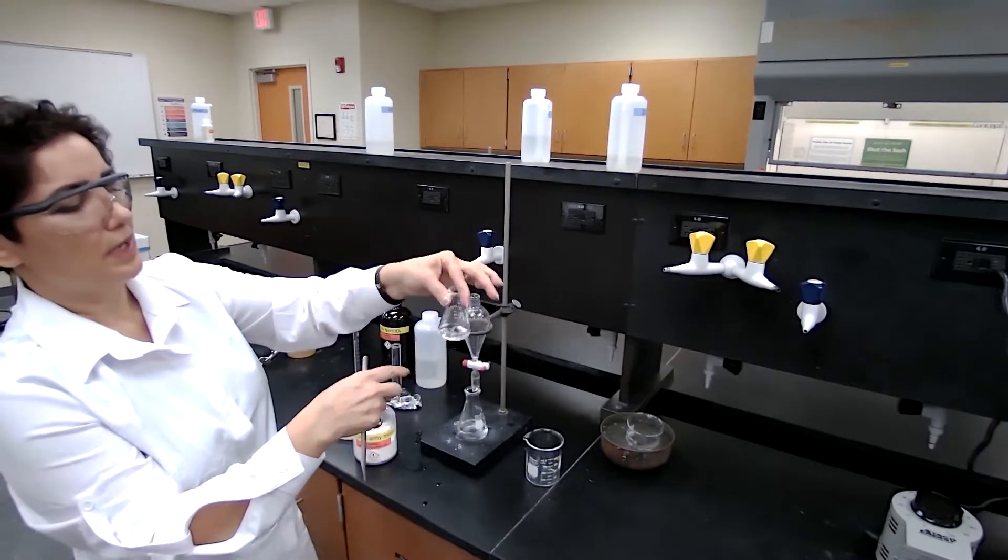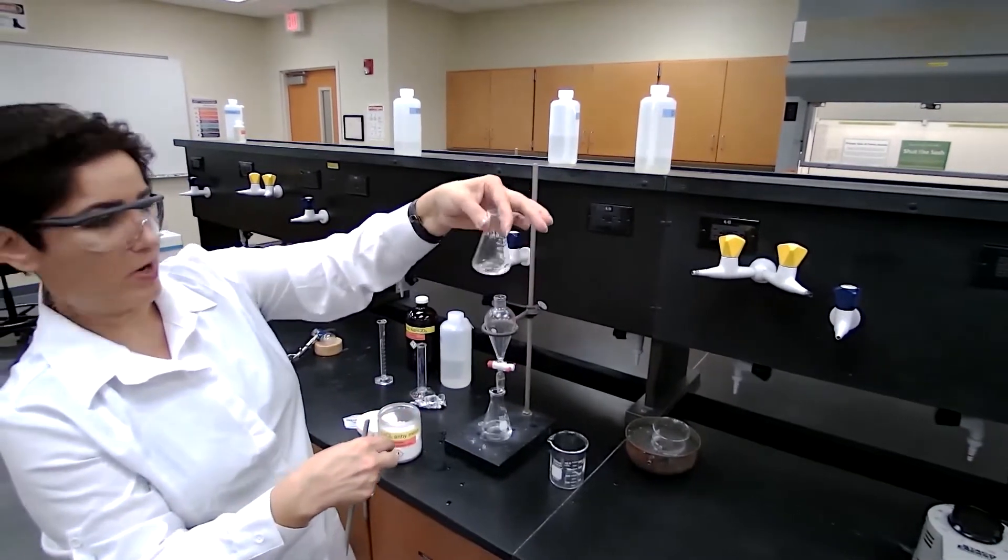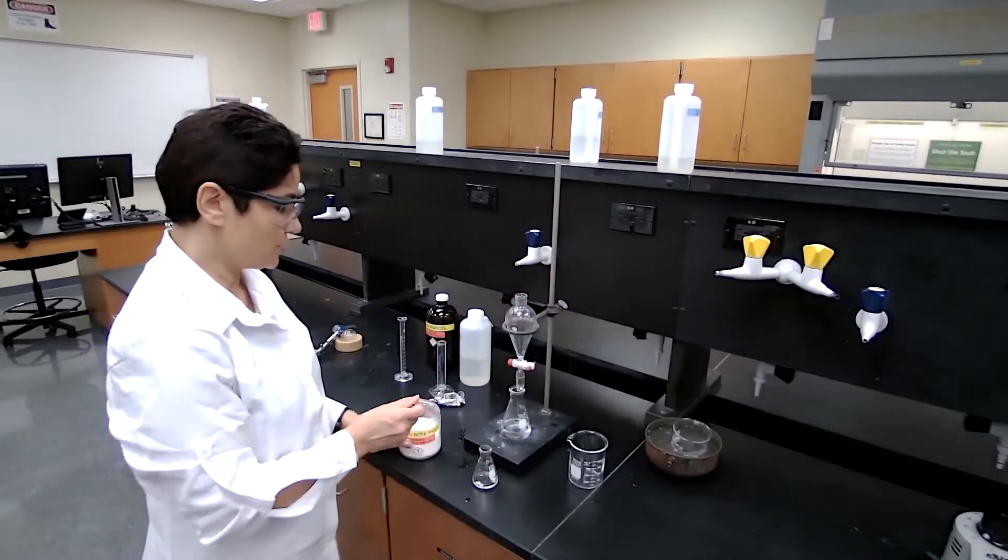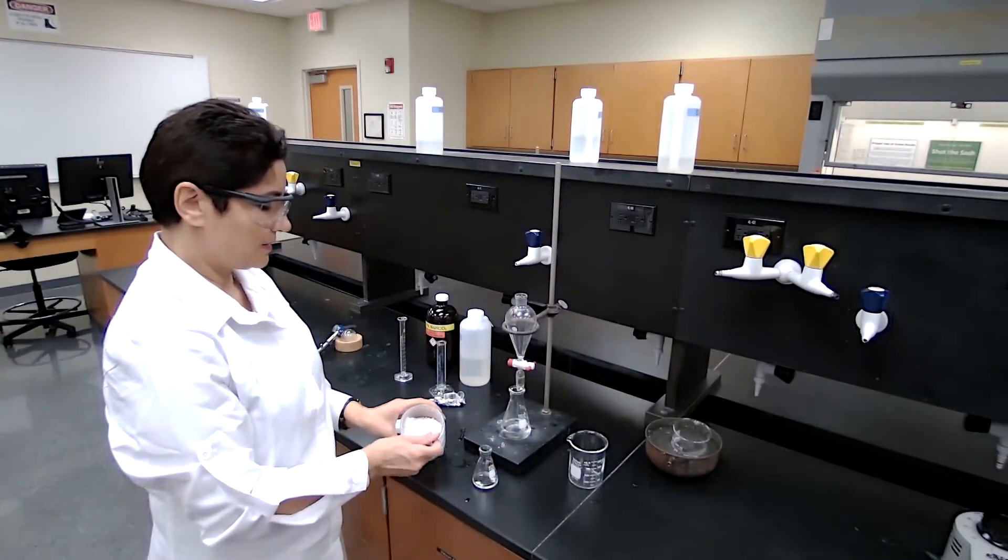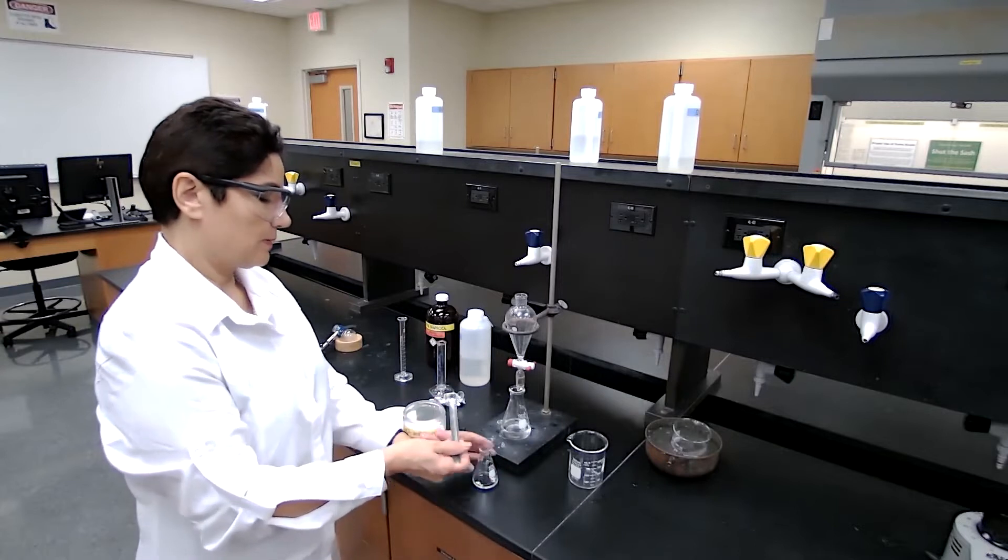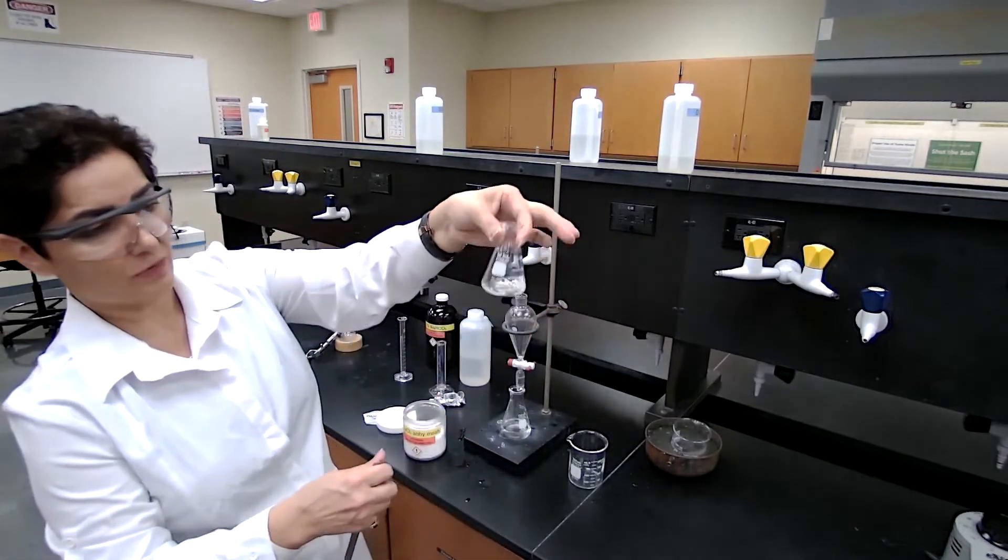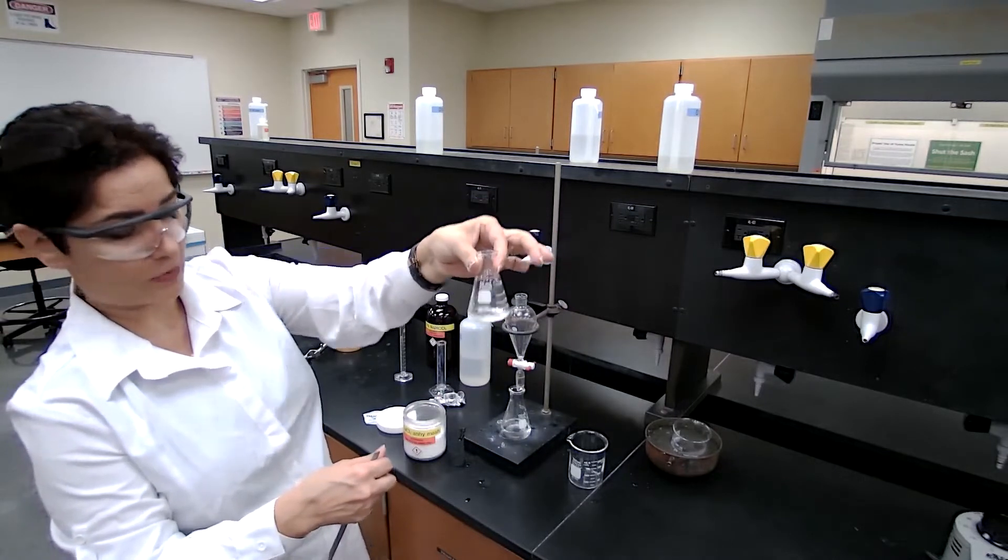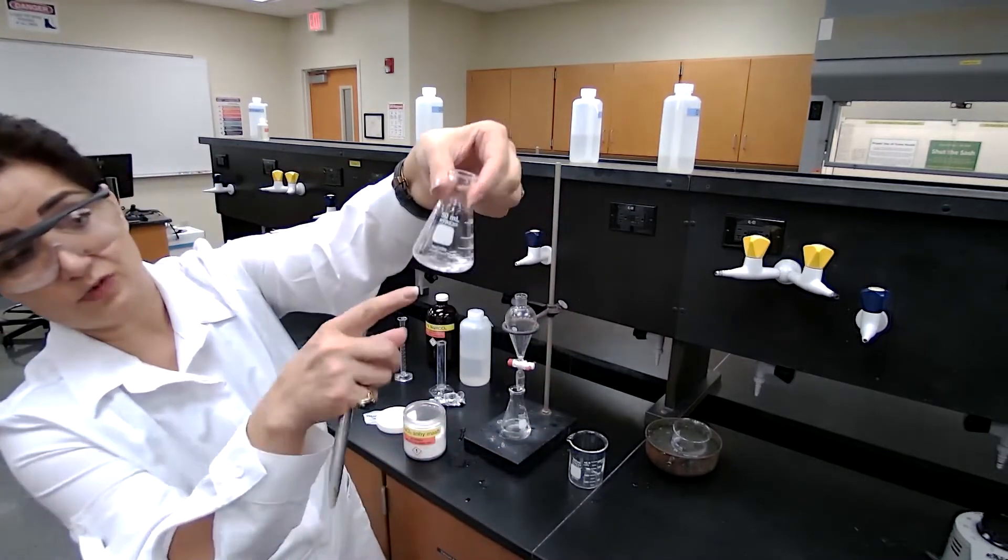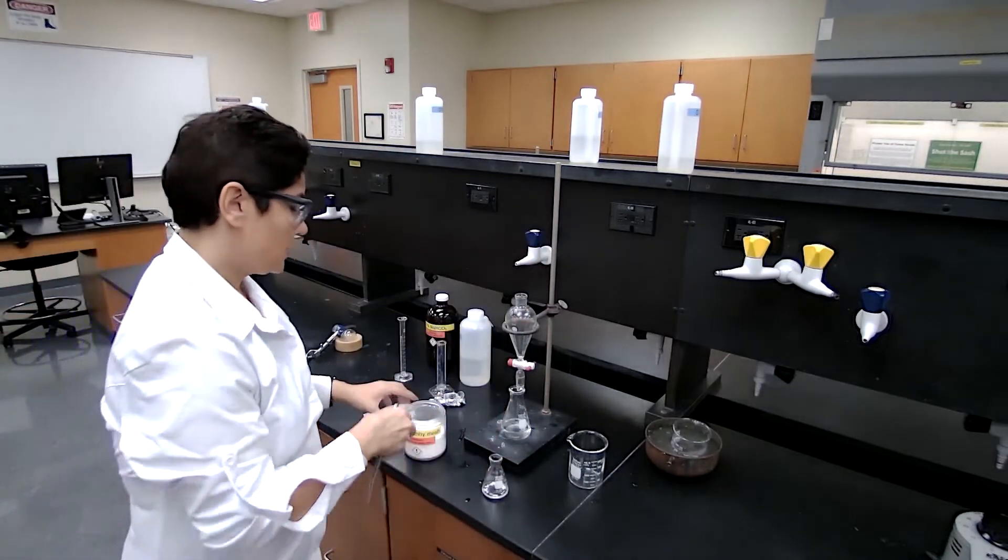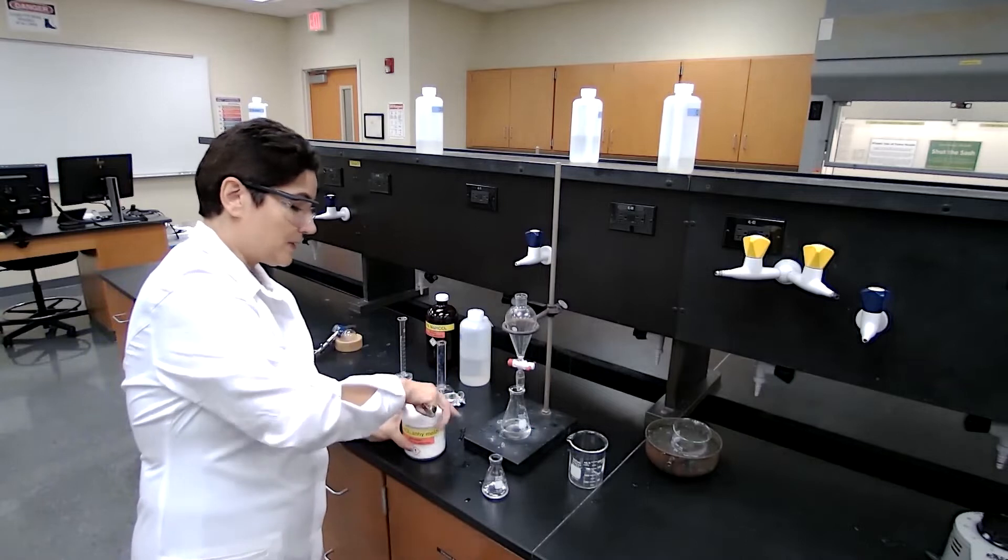When it clumps up, that means you still have some more water molecules or traces of moisture. So you add just a few more pellets or mesh of the anhydrous calcium chloride. Now the calcium chloride is moving around, which means I have added enough.